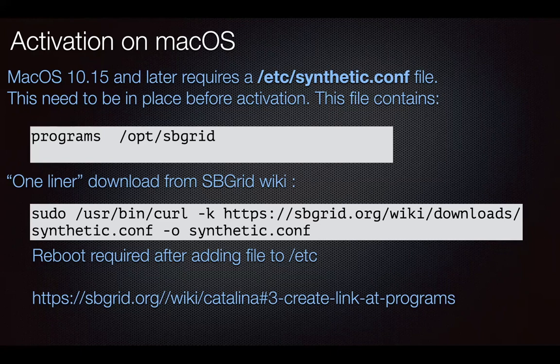But like I said, we're going to make this explicitly managed in the software at some point in the future, so you won't have to do this. And then some point later in the future, hopefully, we'll relocate the whole software stack so that we won't even need to have a link at /programs. But for now, this is required.